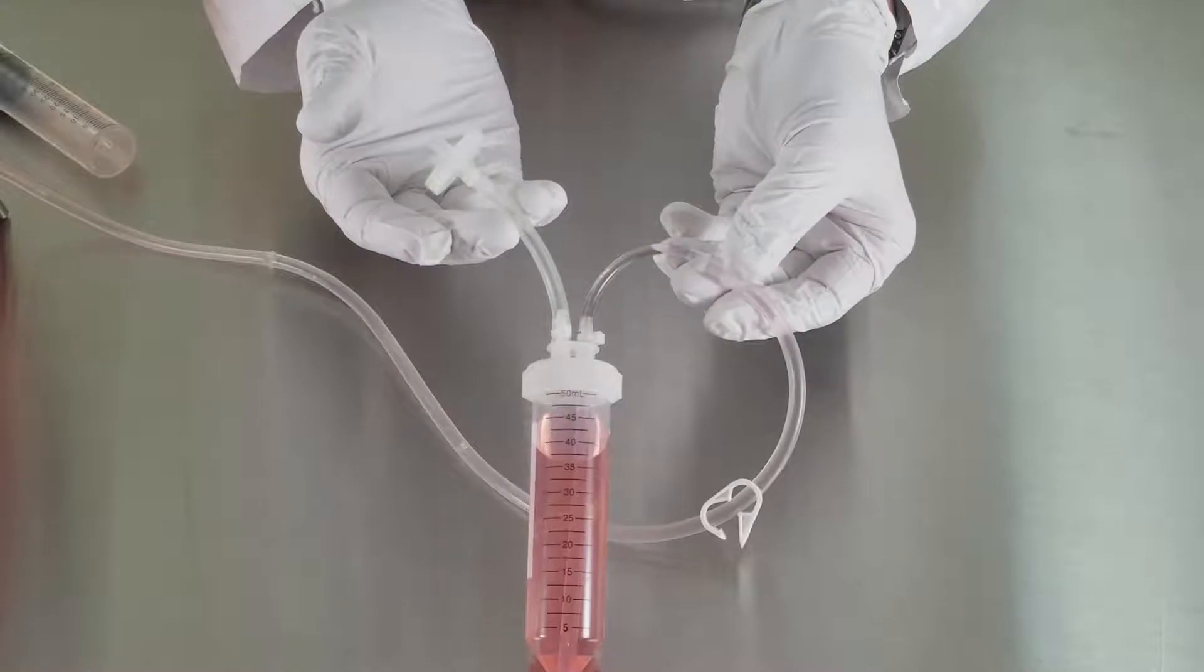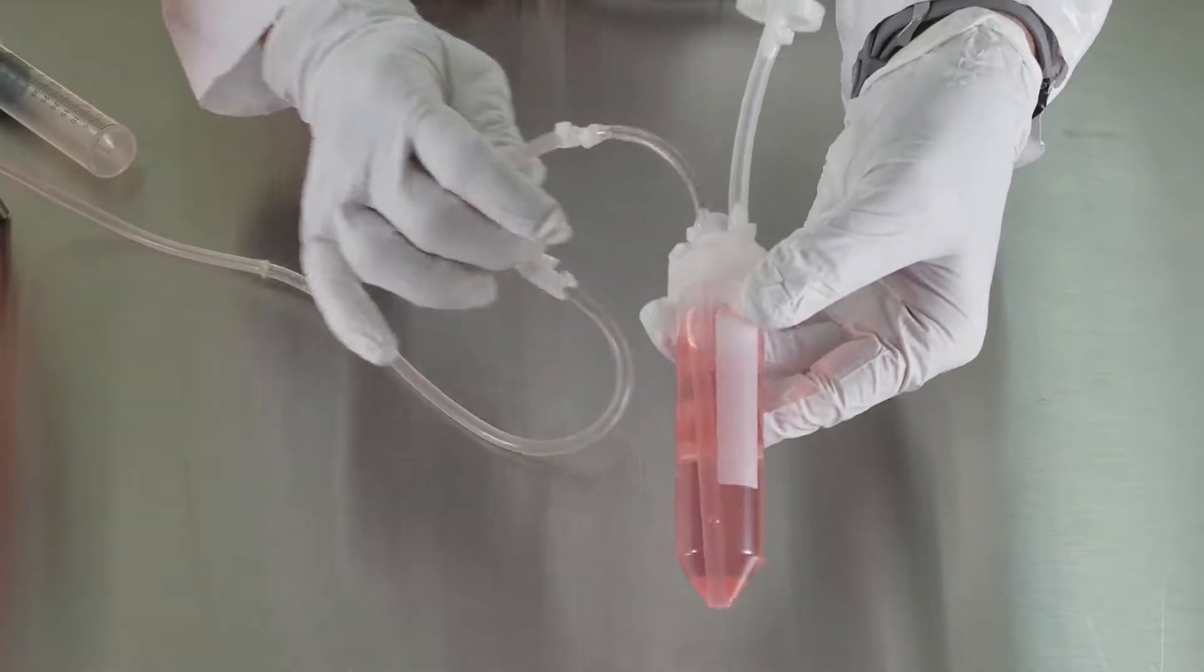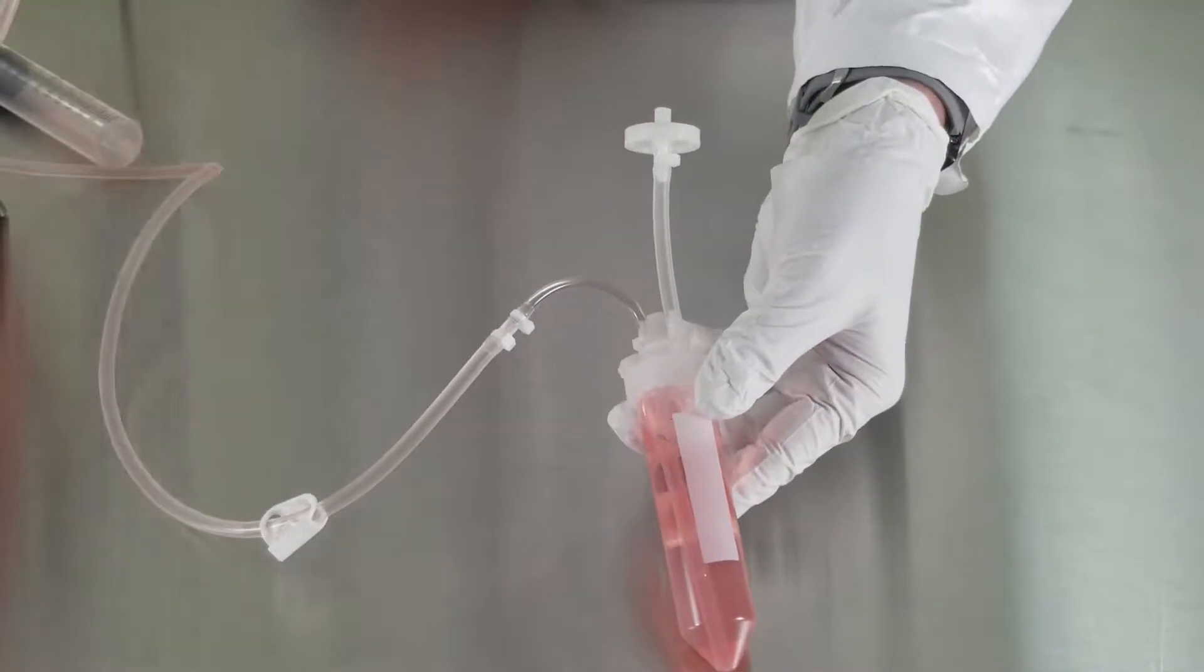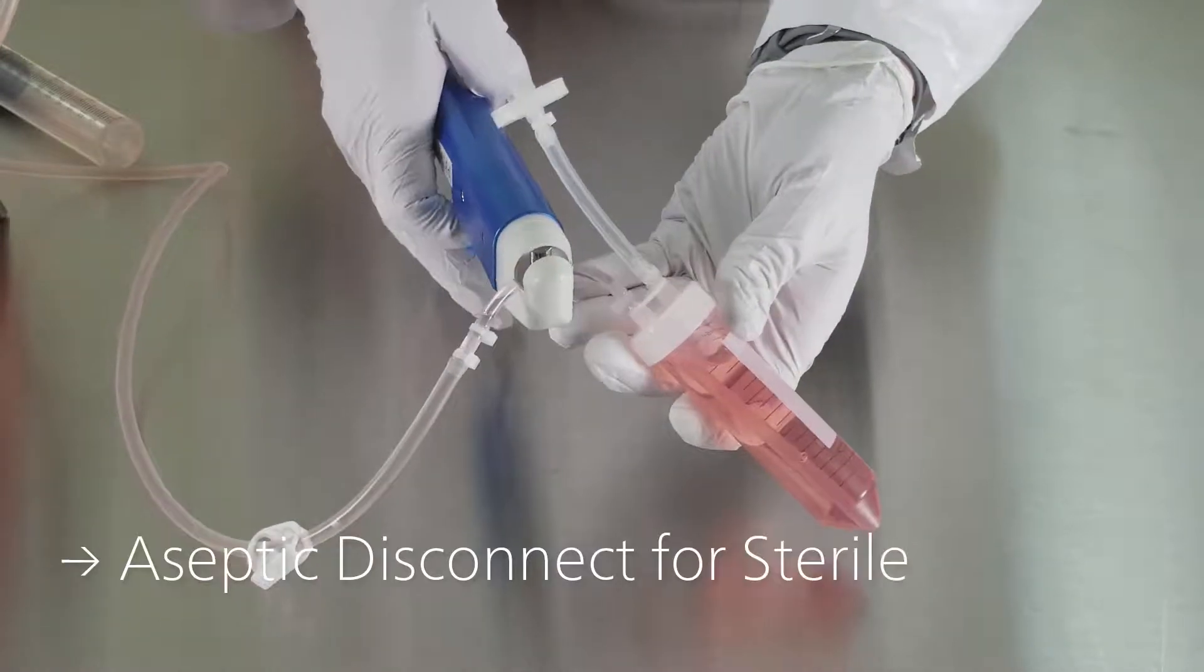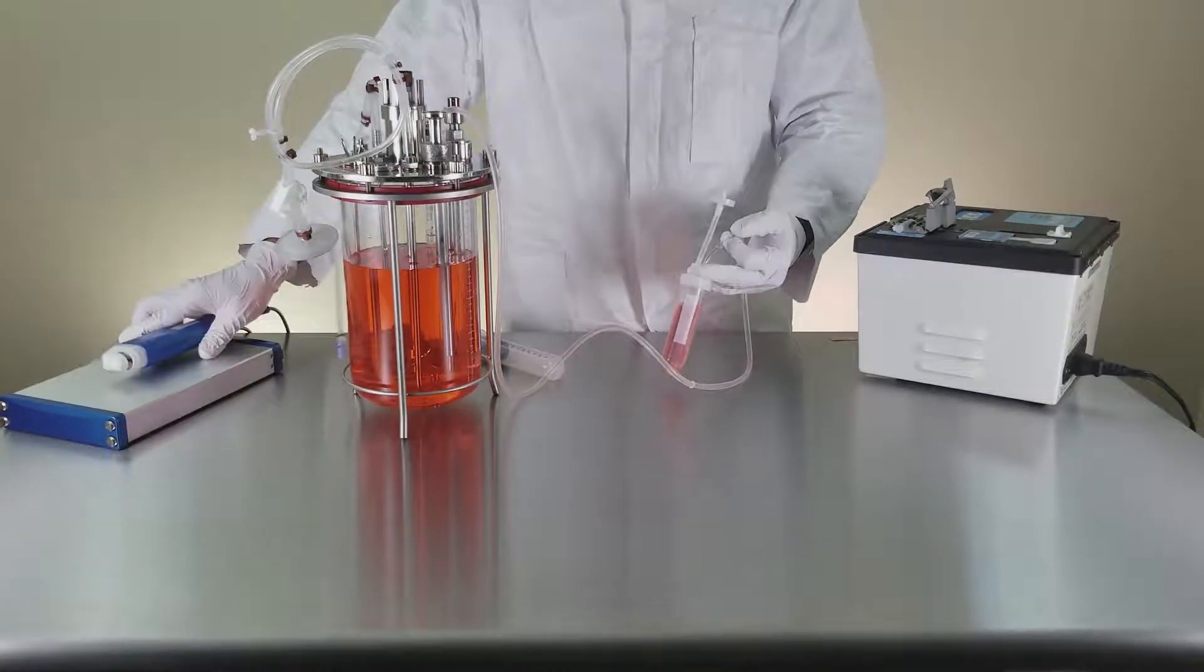For Omnitop tubes, we also offer the Seal and Trim option, featuring a small radio frequency seal-capable tube. This allows you to remove the Omnitop using our Genesis RF tube sealer for aseptic disconnect. This hand-held tool makes a sterile seal and pulls the seal apart.